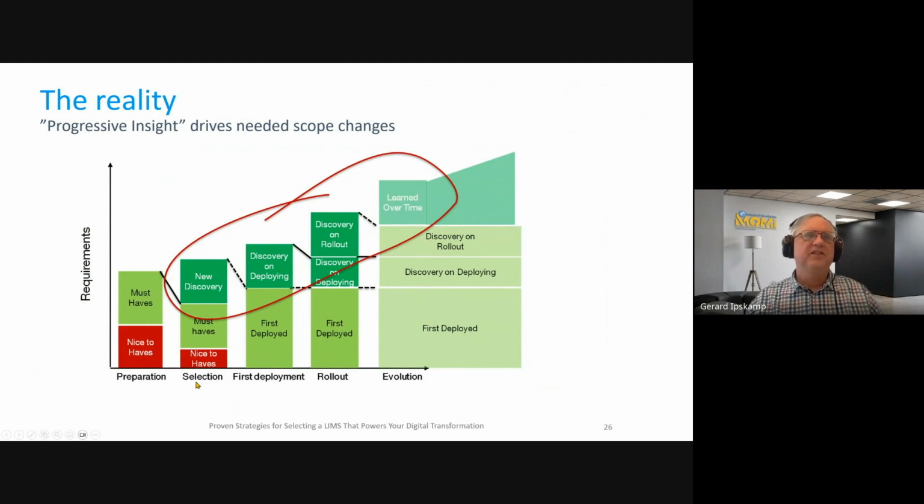So at the selection already, we find out, oh, is that possible in a LIMS system? Oh, let's do that also. So there you start already what we call progressive insight. And with the first deployment, they will say, oh, we didn't tell you this, and we didn't tell you that. Oh yeah, we forgot to tell you this, etc. So prepare in your budget, in a long budget for 3 to 5 years, that this is the real process. With every rollout, you will have new functionalities or new configurations. It's not always customization, but time to implement something that you didn't know about.